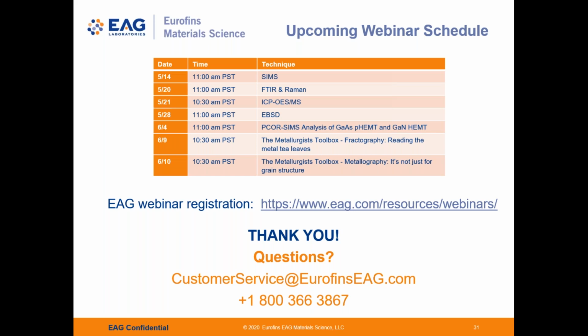And there is another question, that is what software or program we use for data analysis for RBS. This I will elaborate more by myself. Here at EAG, we have our own proprietary software that is poised to analyze data with high throughput more accurately. It is called Rubicon.